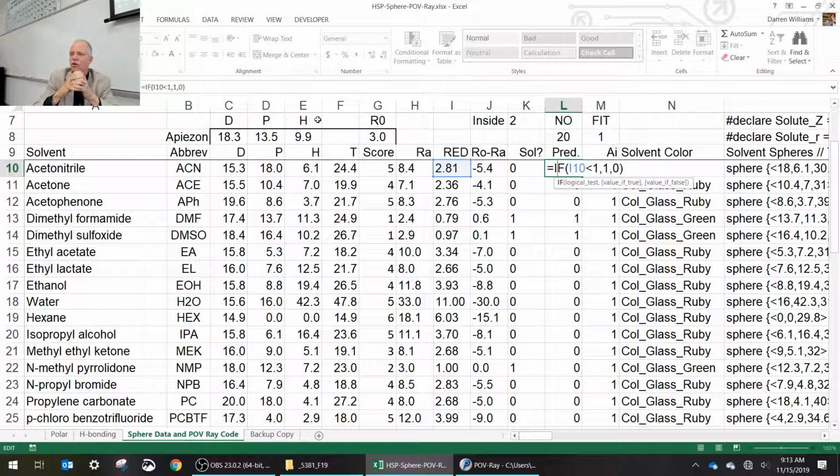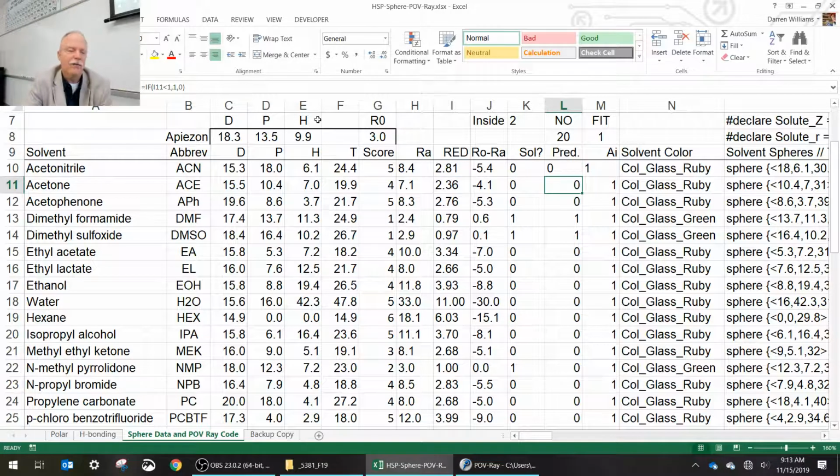And our scores generate the solubility question mark, saying is it a good or bad solvent. And the scores are qualitative, our subjective judgment. So that's one of the criticisms of the Hansen solubility parameter system, that scoring the interactions is subjective. There's really no way around that, in that you just have to come up with what we call good operational definitions. So what's the definition of a 1, 2, 3, 4, 5, and 6?